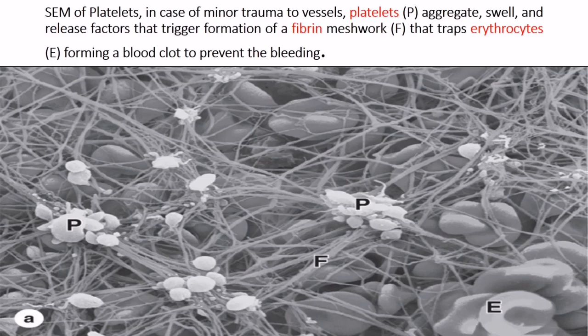Here is a scanning electron microscope image of platelets. In the case of minor trauma to vessels, platelets aggregate, swell, and release factors that trigger the formation of a fibrin network that traps erythrocytes, forming a blood clot to prevent bleeding. A scanning electron microscope image of the blood clot shows the platelet, the fibrin, and the erythrocytes.